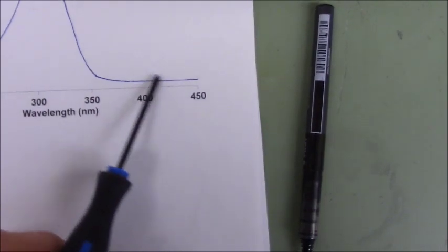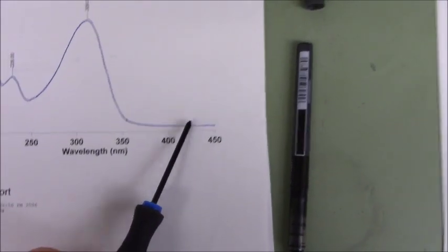So what we can say in our discussion is, look, when you strengthen up your UV visible scan, you can see that the tailing of this does absorb a little bit of the violet. So what's left over for us to see comes out as yellow.